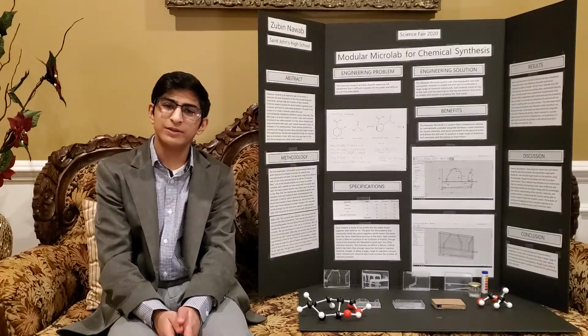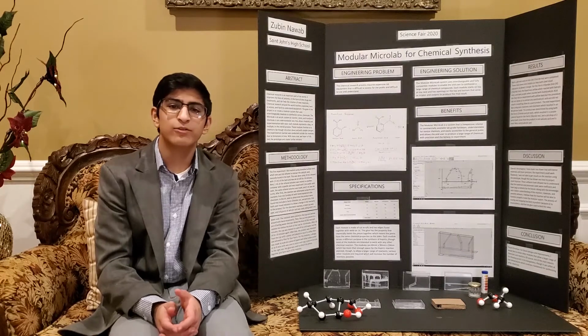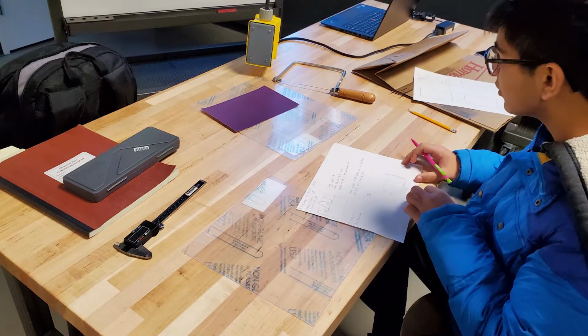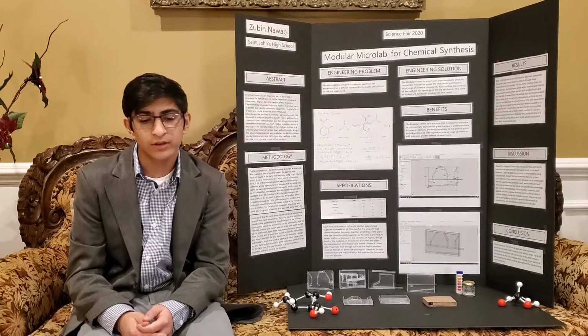Hi, my name is Zubin Nawab, and my project is a modular microlab for chemical synthesis. My project is an engineered system that can be used to synthesize a large range of chemicals. The microlab uses a variety of different modules to perform various steps in a specific reaction. The modules can be added, removed, or replaced.